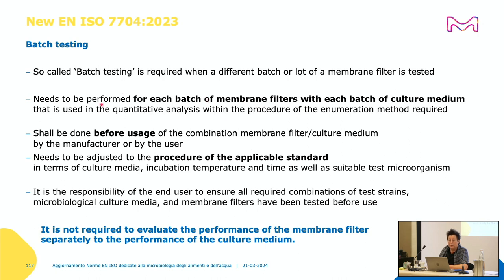So this so-called batch testing is required when a different batch or lot of membrane filters is tested. That is clear. There is a need for each batch of membrane filter to be tested with each batch of culture medium. Only for the quantitative analysis with solid medium, for the enumeration. And this should be done before the usage, of course, or at least in parallel.